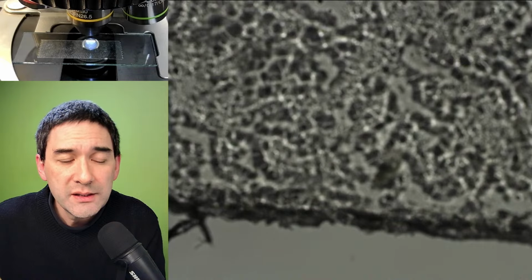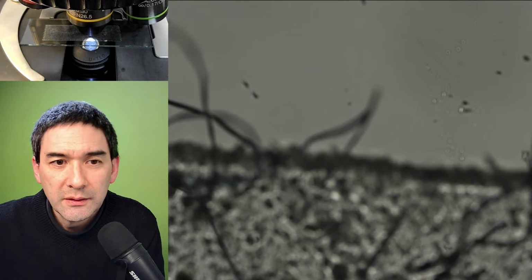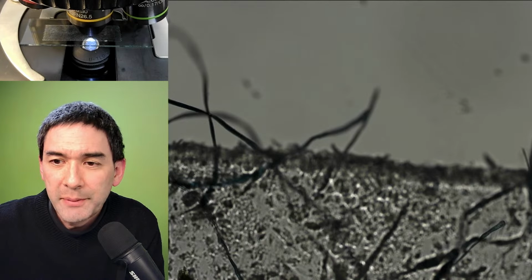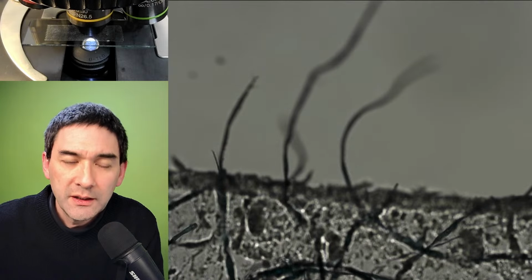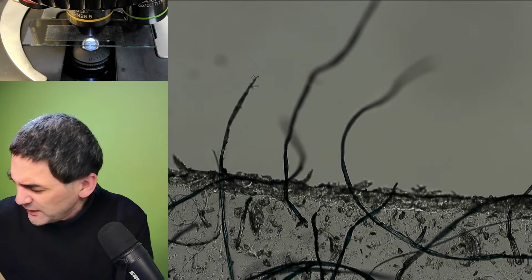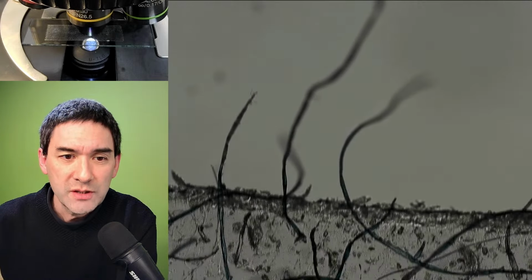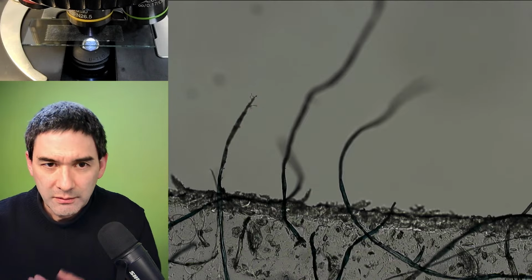I just want to show this to you. Scope. I'm going to just use regular. Let's do it like this, and exactly, here we are. Morgellons disease is paranoia. It's a mental problem where people think there are parasites when there aren't. I basically showed them that the fibers they found are essentially just fibers. I did this in one video, which must still be online from a couple of years ago. I said, look, these are just fibers that are collected. What we've got over here, that's the tape, and over here is the fiber sticking out.